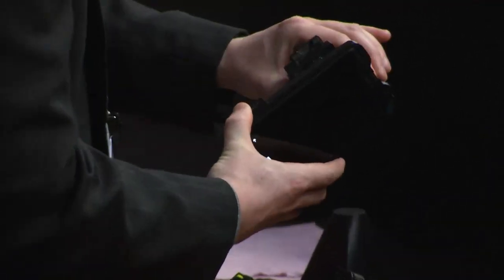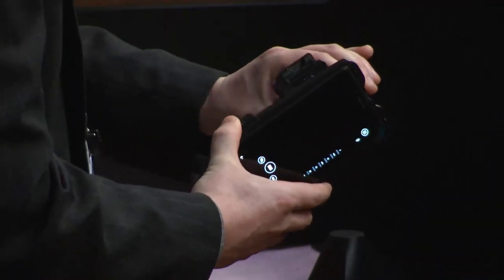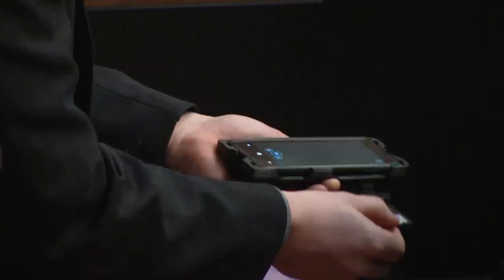So there's this focusing knob, which you can turn. It should be relatively well focused already. Loaded in here is a blood smear, just a drop of blood smeared across the slide. I have other samples here.